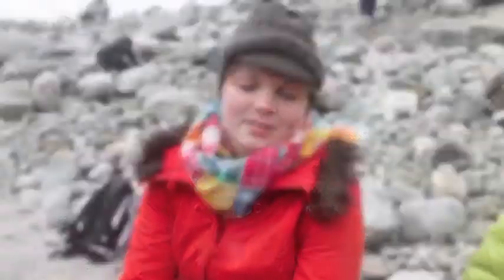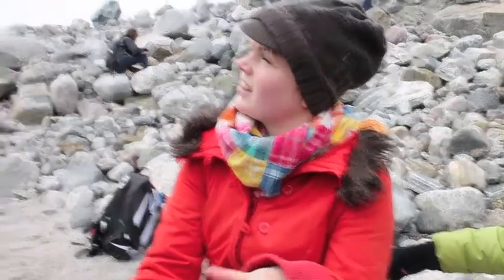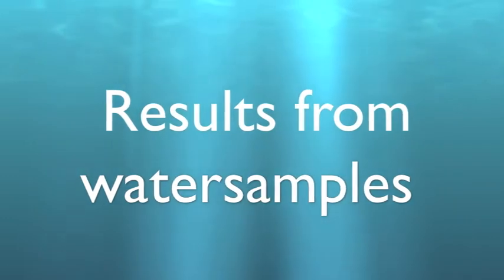Today we are at the glacier with some scientists, and we just took some samples from the meltwater. We filter it to measure the iron concentration, and we also measured the pH, the dissolved oxygen, the temperature and the electrical conductivity.